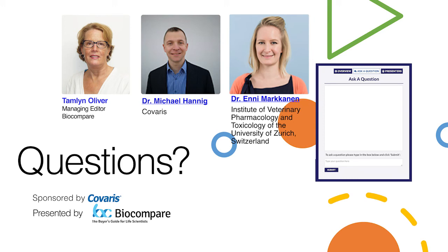So if I remember correctly, the correlation is higher than 0.9. So really high correlation, suggesting that you really get very, very similar results taking either type of tissue.